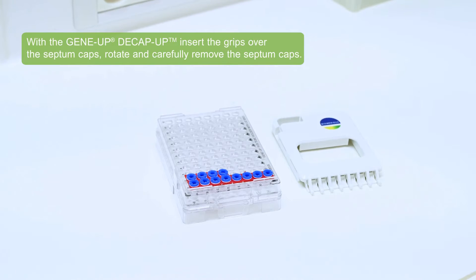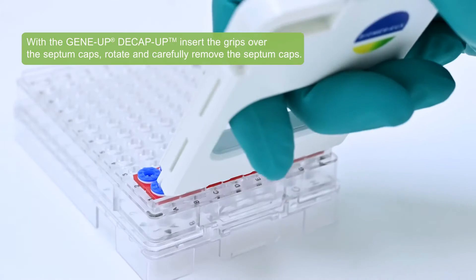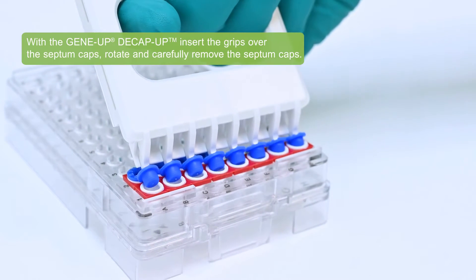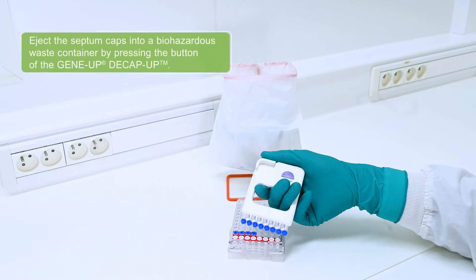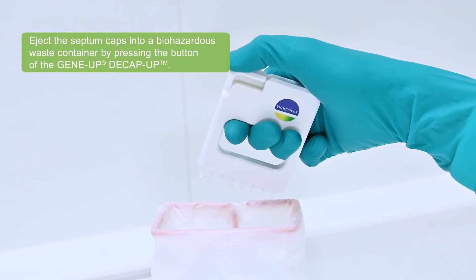With the GeneUp D-Cap Up, insert the grips over the septum cap, rotate and carefully remove the septum caps. Eject the septum caps into a biohazardous waste container by pressing the button of the GeneUp D-Cap Up.